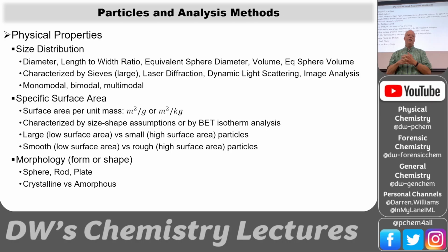And then you can get down into the microscopy and look at the shape of the particles, whether they're spheres or rods or plates, whether they're crystalline or amorphous. So there's lots of different physical properties of particles, and today we're going to talk about how to measure those.